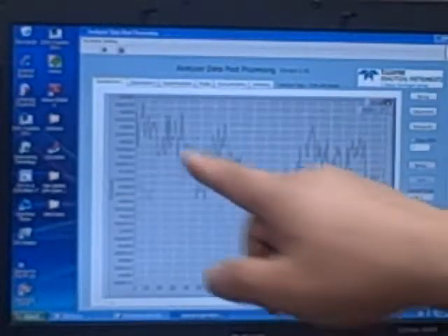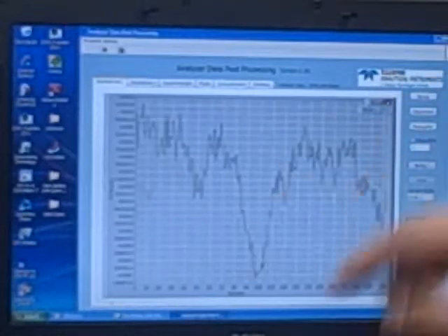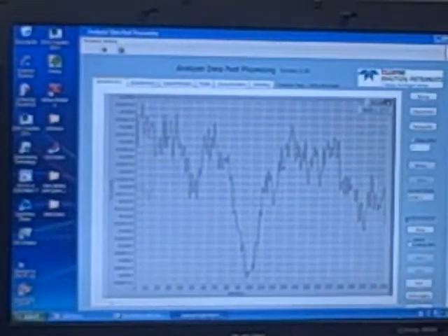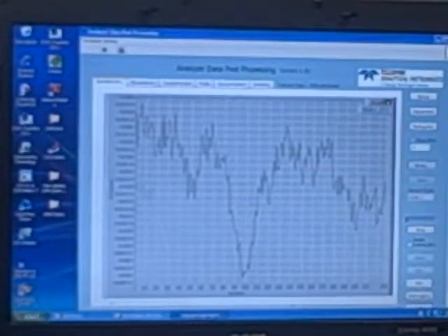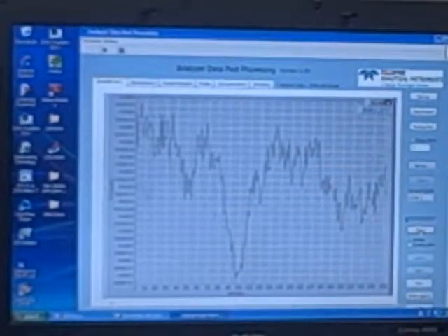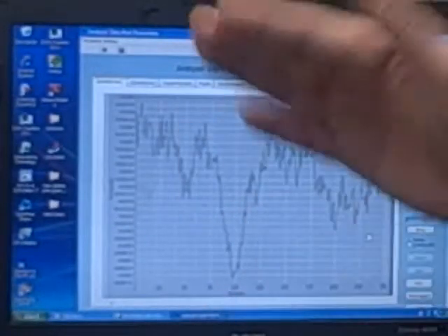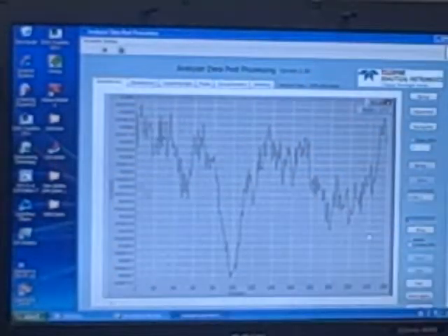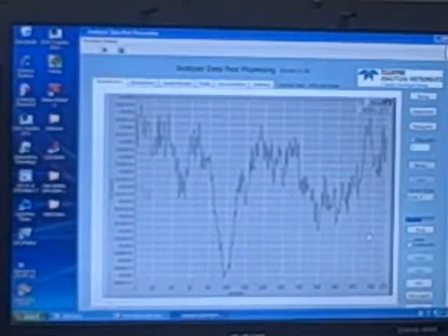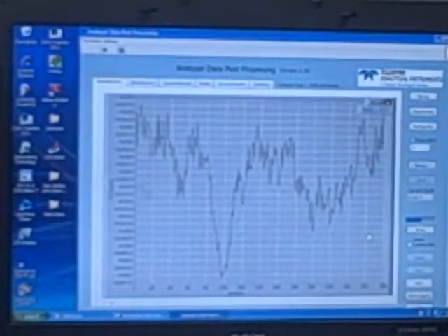And by the way, this portion is the communication. This portion is for data processing. And I'm waiting for its next cycle. And you can always stop anytime. If some cycle is already done, you can stop it and the data will be saved as soon as it is within its maximum. Okay, now it says we are in cycle 2, measurement.